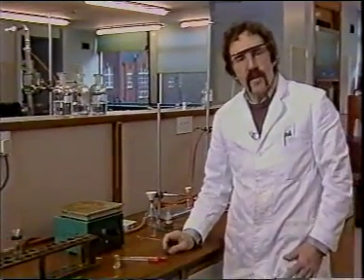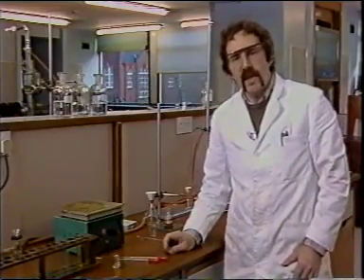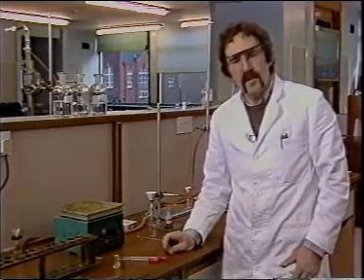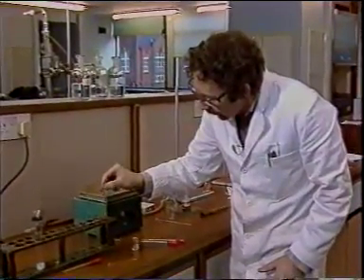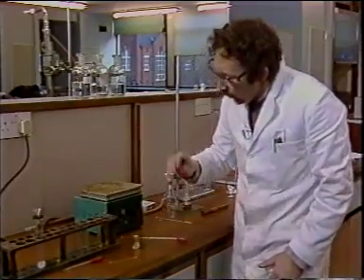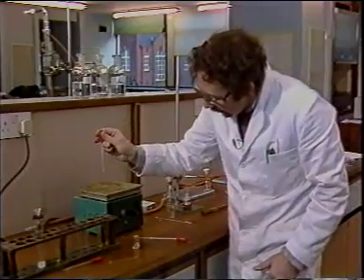When we need to obtain a small amount of solid for analysis, we can't risk contaminating our sample with filter paper hairs, and so all glass apparatus must be used. If we use one of these cone-shaped tubes, we can drain off the mother liquor using a dropper pipette.